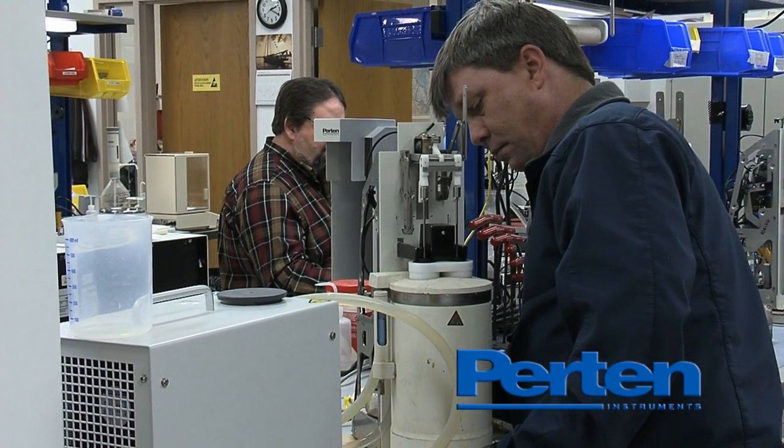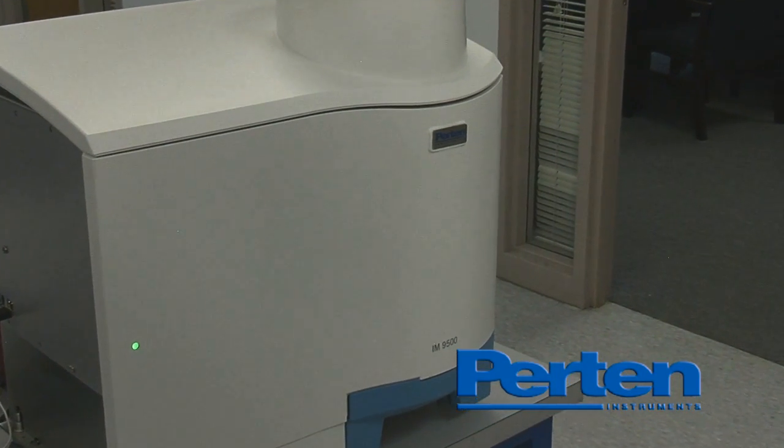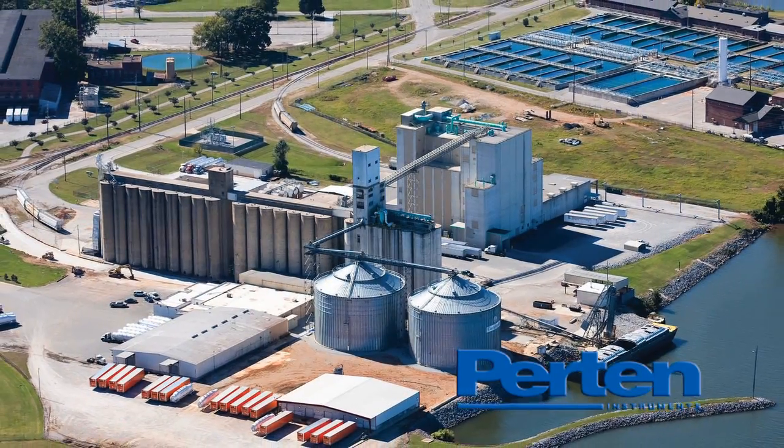Perten is the world's largest provider of grain instruments, as well as analytical equipment for food process controls, dairy, biofuels, soybean crushing, pet food, feed, and other products.